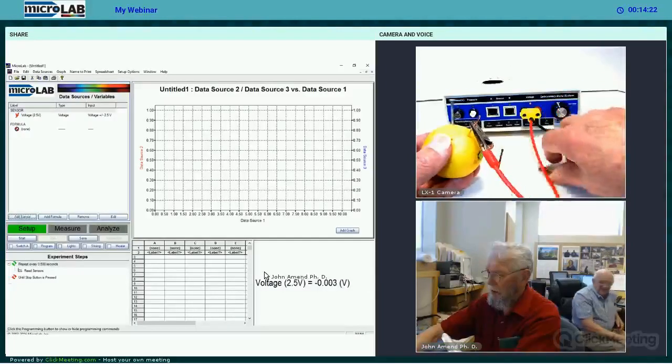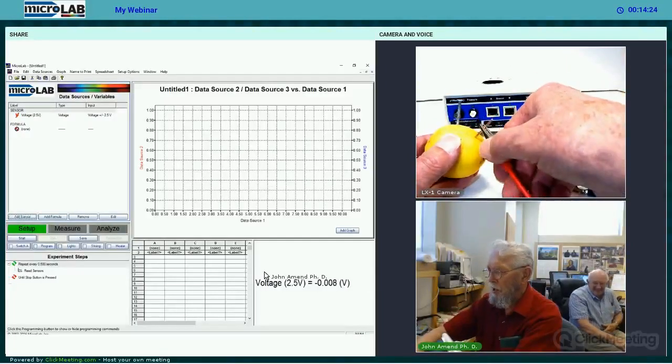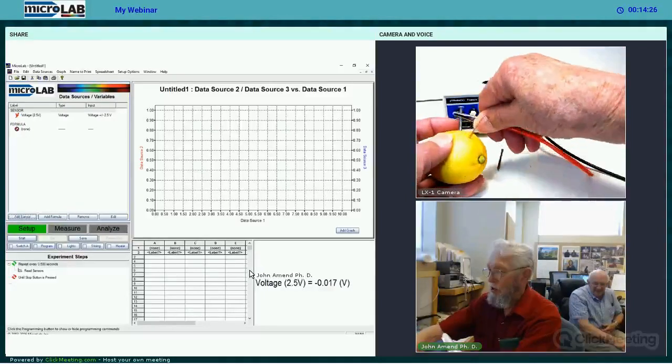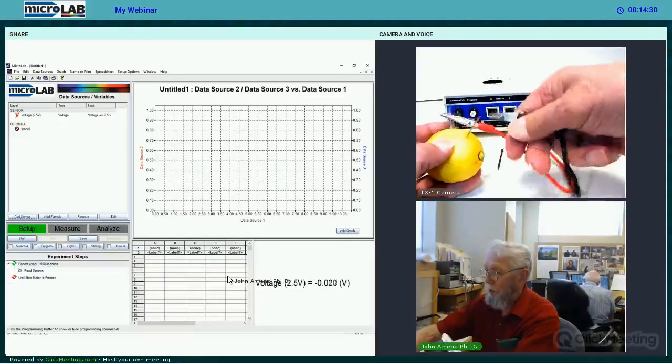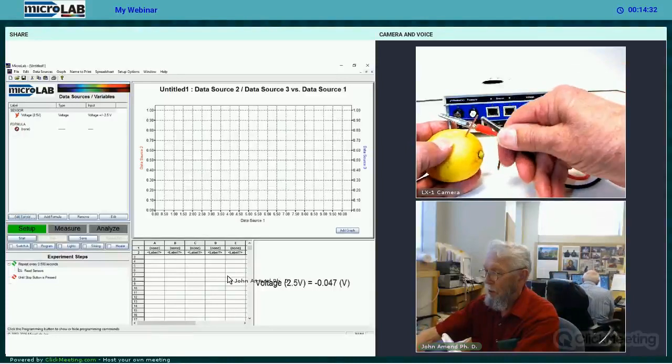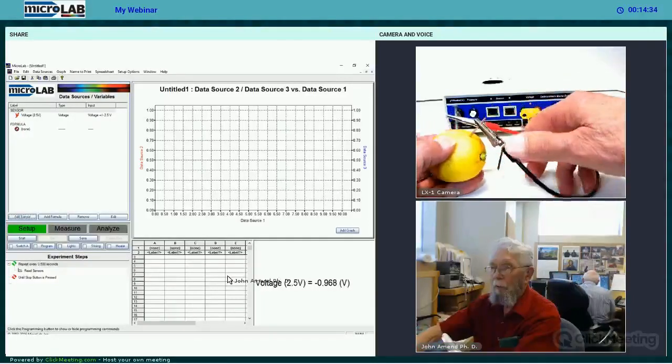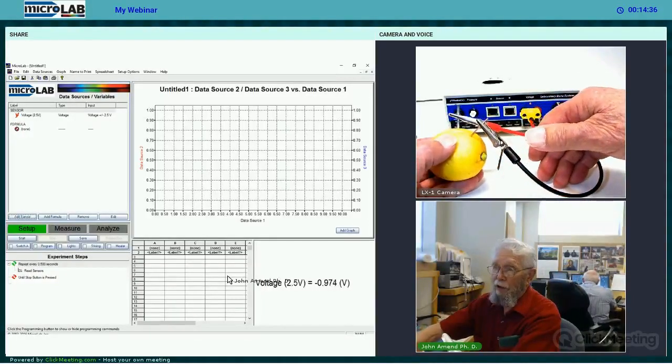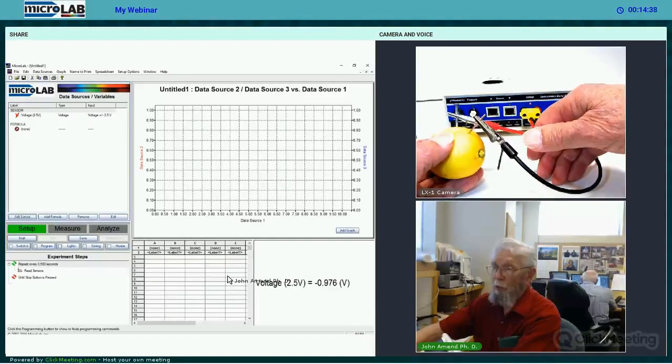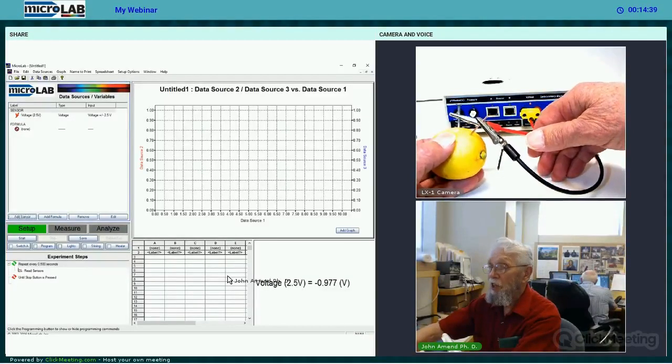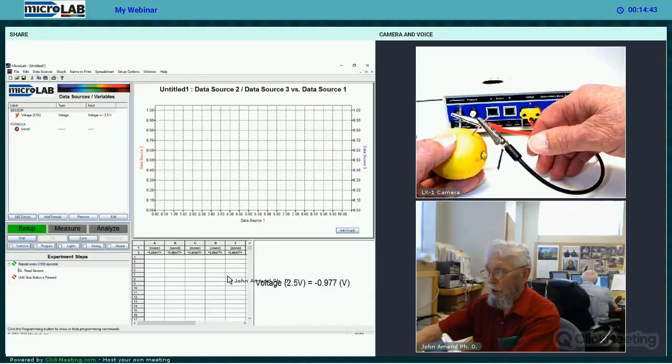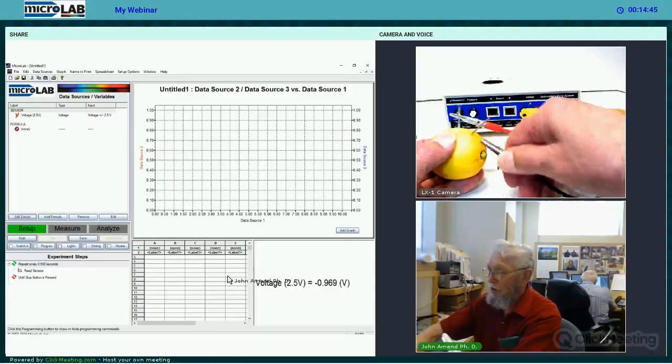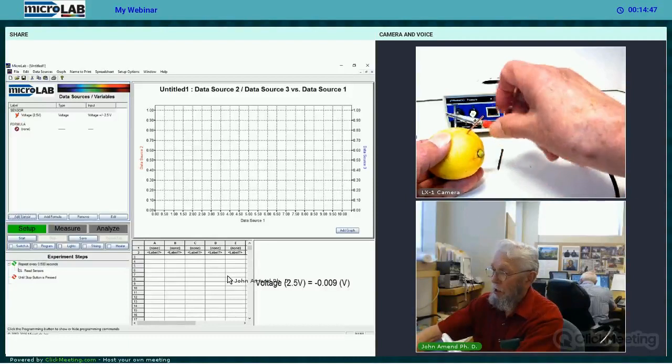As a matter of fact, what if we had connected it in the reverse direction? Let's try it. If we're connected in the reverse direction, we get 0.974 volts, or roughly the same as we had before, with one big exception. If you'll note the negative sign in front of this voltage.